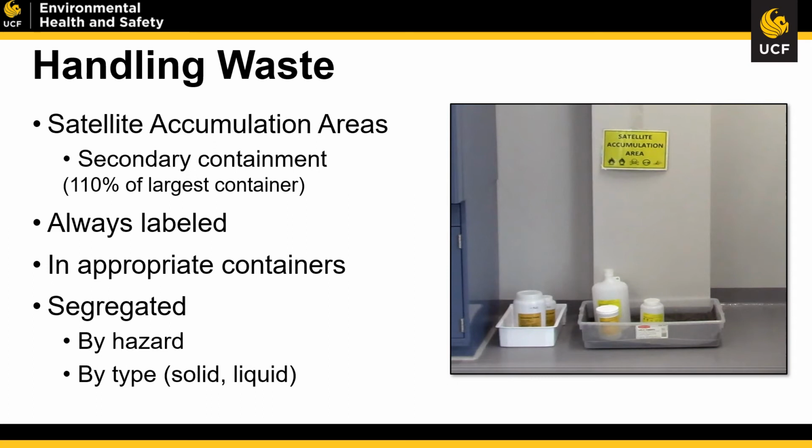Containers do need to be stored so that the container is not overfilled. We always recommend that a container be filled to about 90%. So if you start seeing the curve at the top, go ahead and stop before you get to that curve. When containers are filled and you're no longer adding anything else, please make sure you put your hazardous waste request in so that we can remove the material in a timely manner.